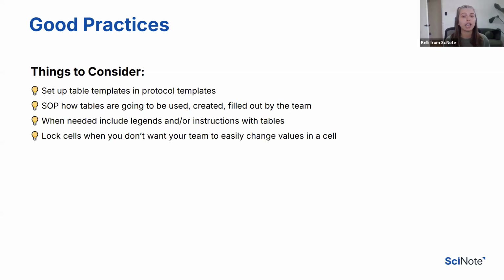It also will save you time, because you already have the created formulas and won't have to create them from scratch each time you're in your protocol. Include in your SOP of use how the tables are going to be used, how they're going to be created, and who's going to be filling them out on your team. Really outline it to keep the guesswork out of it.